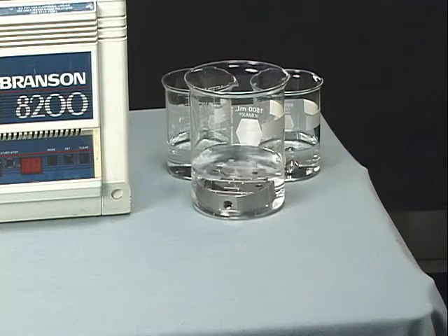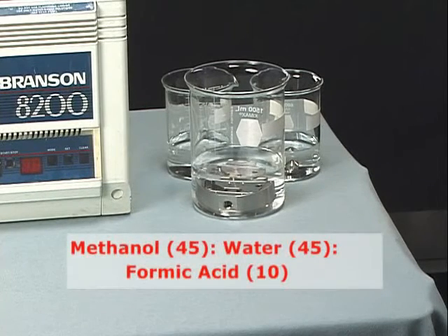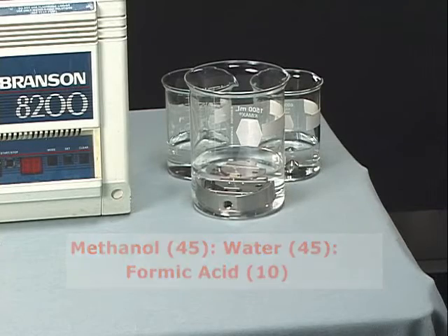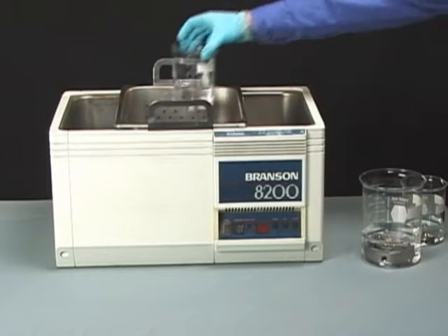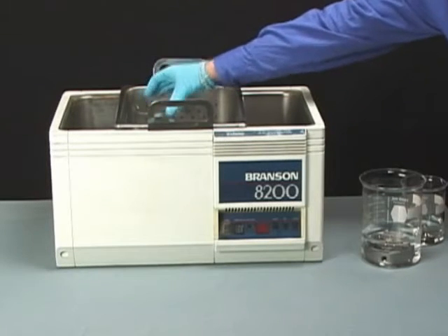If the components are obviously contaminated, use a solution of up to 10% formic acid — for example, a 45-45-10 solution of methanol, water, and formic acid. Sonicate the vessels containing the sample and gas cones and ion block for 30 minutes.